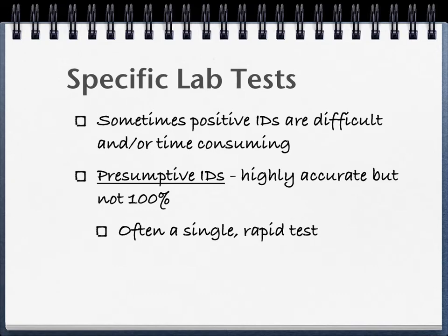It's often a single rapid test. Oftentimes, results come in less than a few minutes, right? In fact, for some of the tests we're going to see today, the results will come in almost instantly. So almost instantly, you know what your presumptive ID is, right?